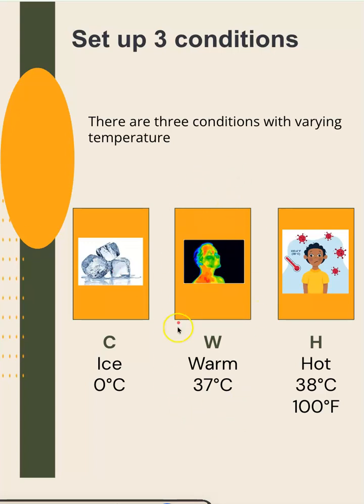That's our second condition. Our second condition is mimicking the body temperature. So this is the condition in which the enzyme works the most ideal. Similar to when we have a fever, our body doesn't feel that great. And the enzymes, similar to what we mentioned before with the egg white, when the enzyme is placed at a higher temperature, it starts denaturing and it starts becoming inactive. By becoming inactive, we mean that the enzyme is no longer able to find the substrates to convert to product.